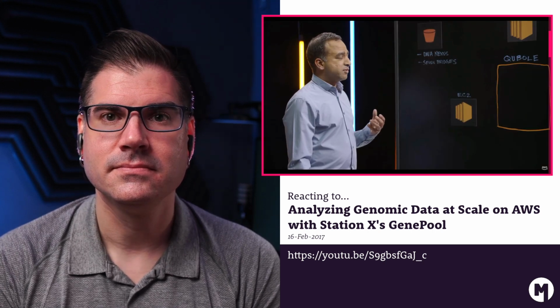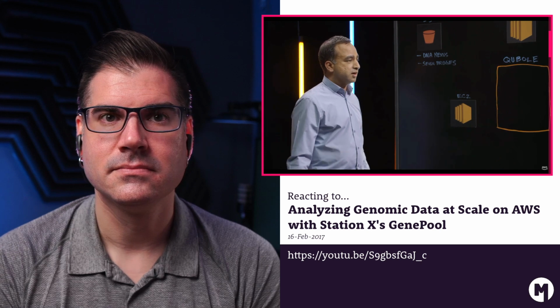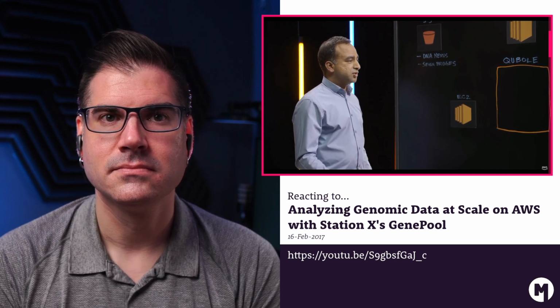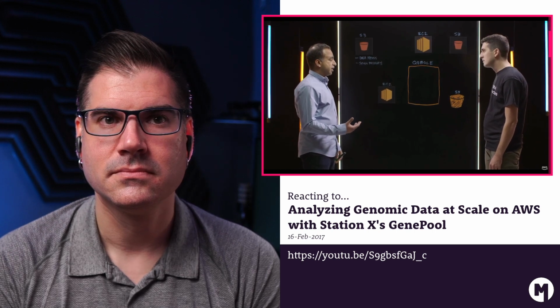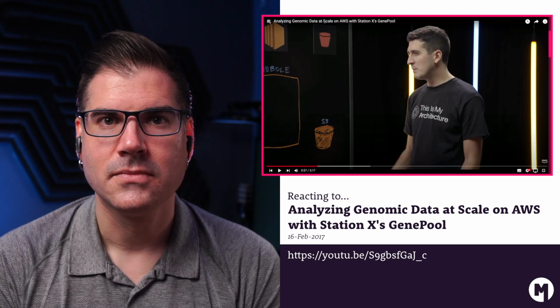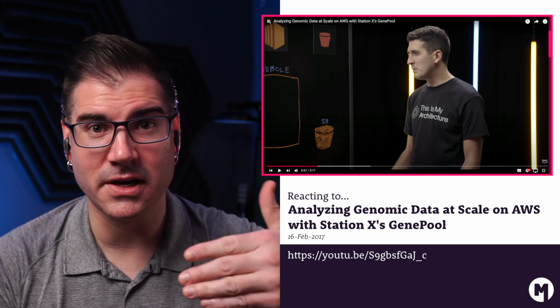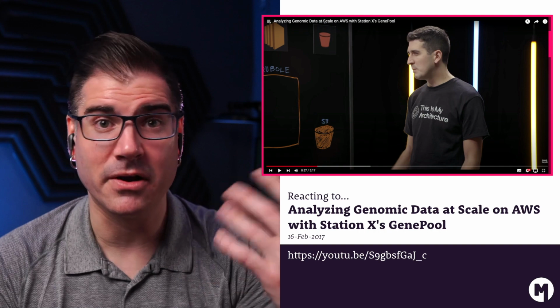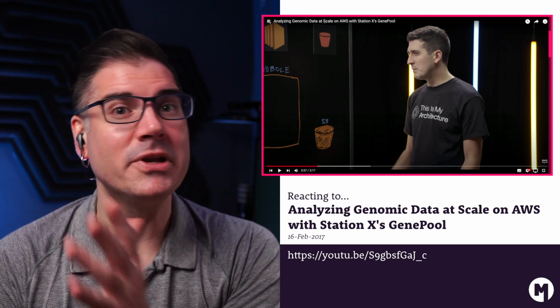Then we have a number of partners that we work with, such as DNA Nexus and Seven Bridges. What they're focused on is assembling that data, mapping it to the genome, and finding positions of the genome that vary between the patient's genome and a reference genome. So they're looking at the model: this is the standard based on the Genomics project, mapping out the human genome. This is what this patient is expressing differently. And then here's what we know about those pathways.